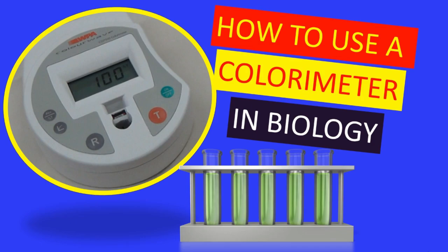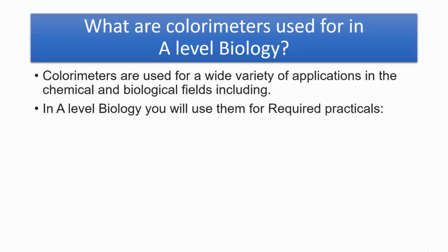How to use a colorimeter in biology. Colorimeters are used for a wide variety of applications in the chemical and biological fields. In A-level biology, you will use them for required practicals.